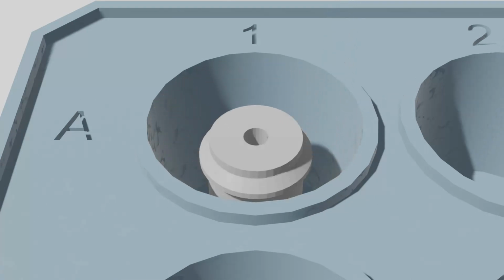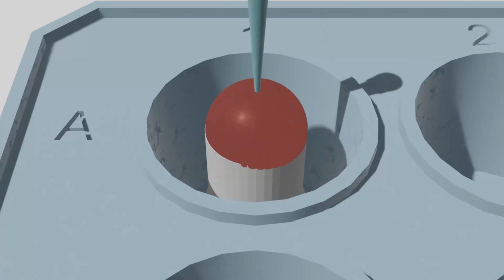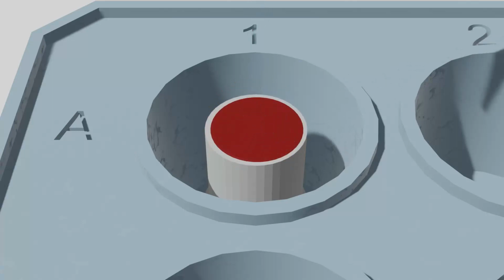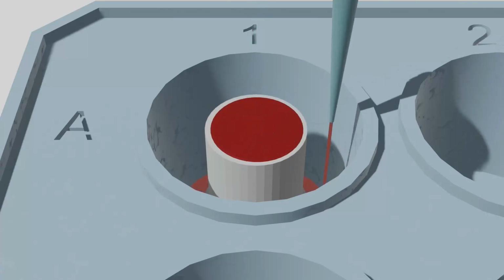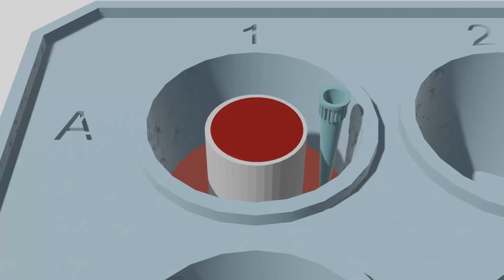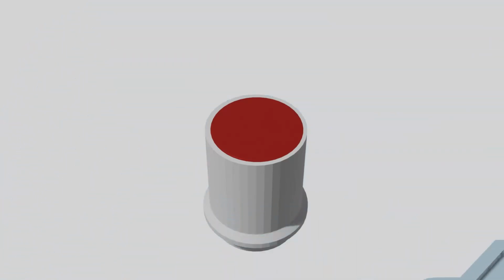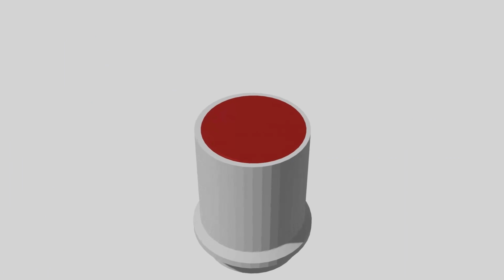Once the gel is fully set and swelled, we will then flip our device over and seed our surface with corneal endothelial cells and media via a droplet. We allow the cells 1 to 2 days to fully adhere to the surface of the gelatin and device, and after this 1 to 2 day window, we then transfer our tube into a 24-well plate, where we will then submerge the device in cell growth media to allow for a proper flow of nutrients.